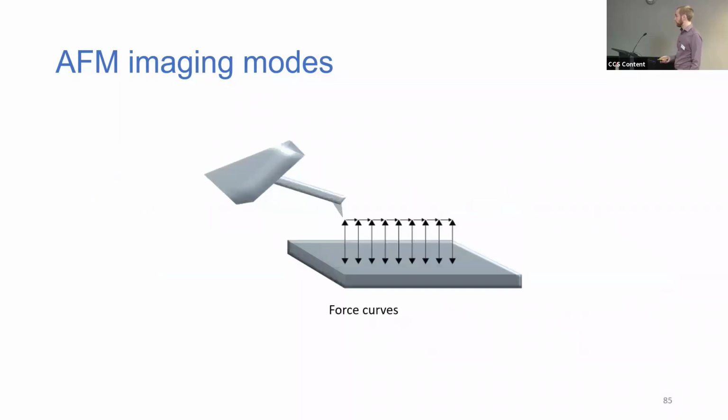So in my work, I use force curves mode. This is purely because we've got the best image quality and consistency in liquid systems than when we tried tapping mode.